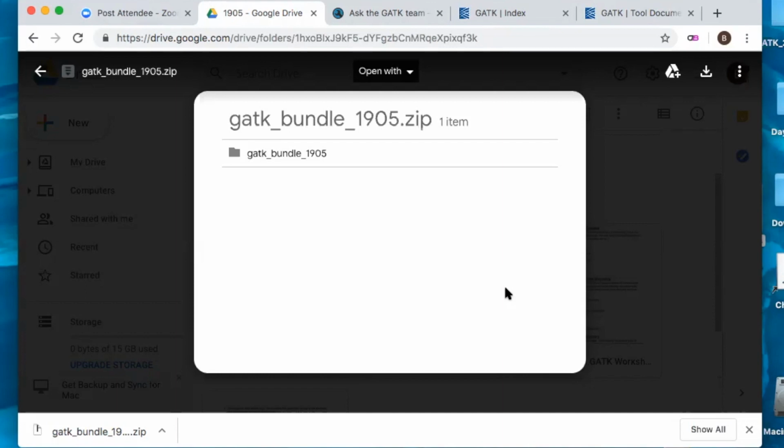For the next 30 to 45 minutes, we're going to try and cover 6 different things. The first one is to just take a simple WDL and run it. We'll see how to configure the inputs and how to run a chain of different tasks together.